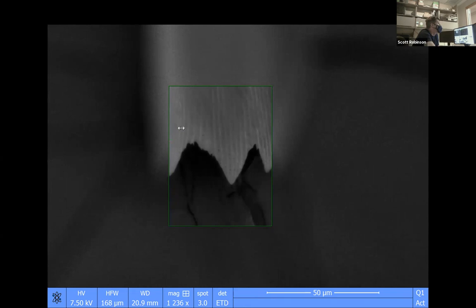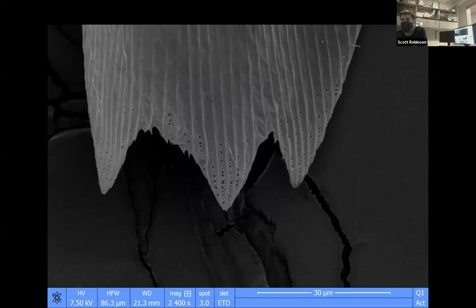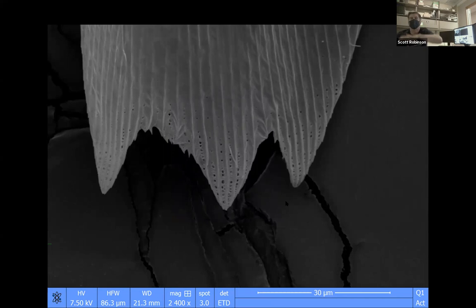So that cracking in the background is the gold palladium cracking, right? Does that happen because the plate's a little bit older, or is that something that happens when you coat the samples, no matter what? You see how there are cracks in the background? It's going to dry because there's a vacuum, and so we're going to see those cracks. So if we had a really flat, smooth sample, and we coated it with gold palladium to make the sample conductive, if we went to a really high magnification and got really good focus on the gold palladium on the surface of something that's smooth, the gold palladium looks like dried mud.